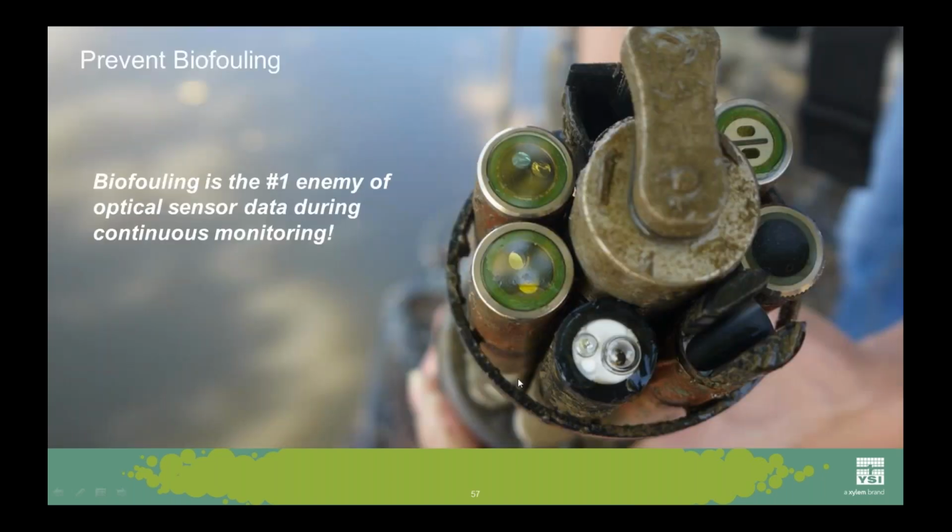But it ends up, and here's the answer to that poll question, that biofouling is the number one scourge of algae monitoring and continuous monitoring in general. It costs people a lot of time and money, especially for optical sensors. Now let's quickly review why that matters.